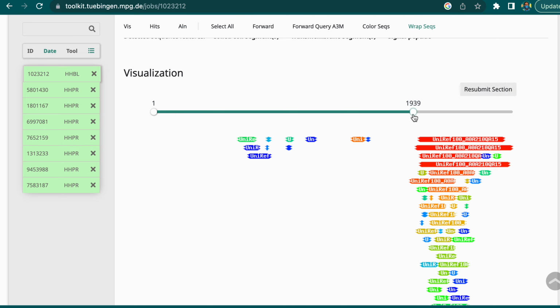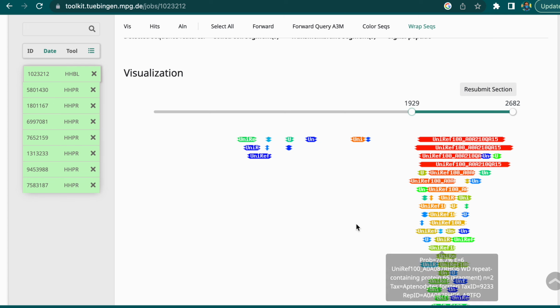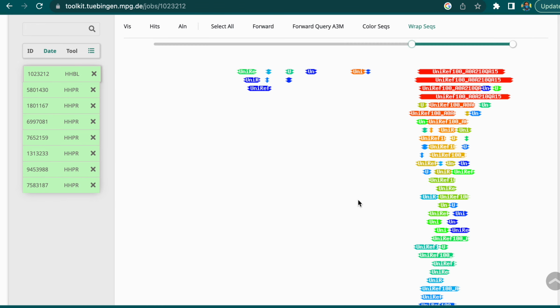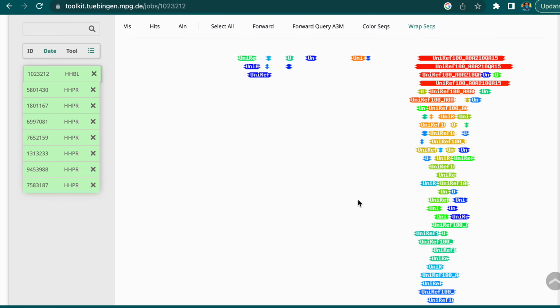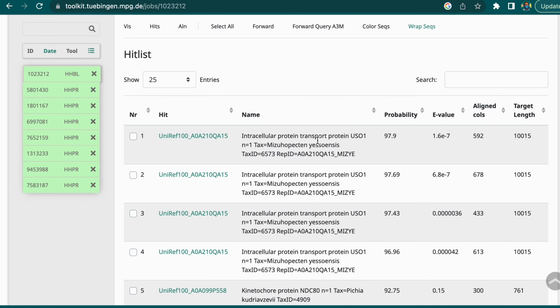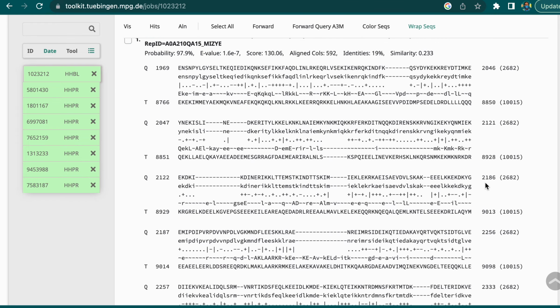These are the hits. The hits are color-coded, kind of the same way that BLAST hits are color-coded. So hot colors like red are good. Green is pretty iffy. Blue is almost always incorrect. And they do give you black hits, and those are usually not good. But that's just when it cannot find any meaningful way to say anything else about a particular sequence. So there you go. All right, down here, so you can click on these. Sometimes that's a little hard depending on the screen sizing, but if you click it, it'll take you down there.